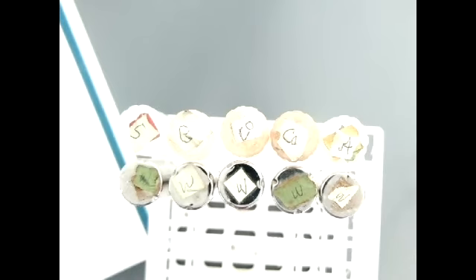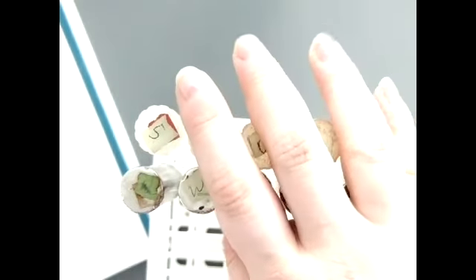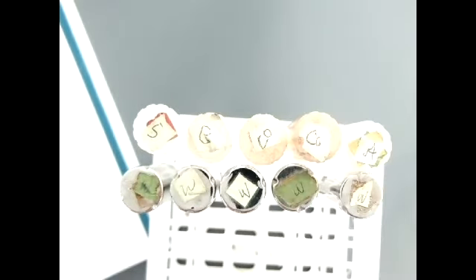So then step B, add to the test tubes 1 dropper full, which is approximately a milliliter, of the substances to be tested. So these are all labeled, and I have already added those substances. Step C is to add the reagents to the appropriate test tubes and perform each test. Now, these tests are individually listed on the prior pages.